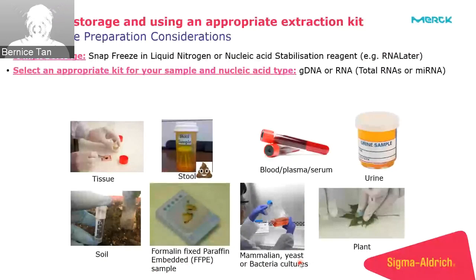You also need to think about whether you're extracting DNA or RNA, and with RNA, whether you're looking at total RNA or you want to enrich for small RNAs. So there are specific kits for specific applications.